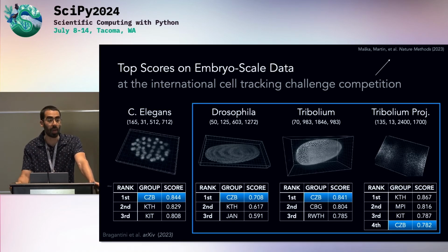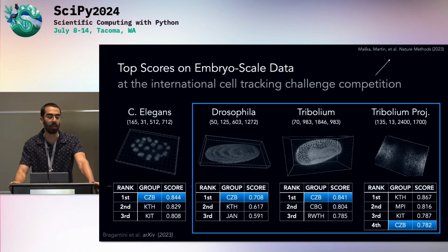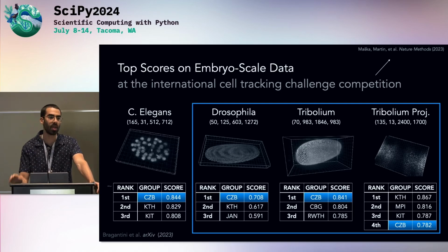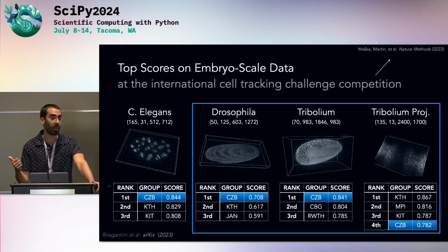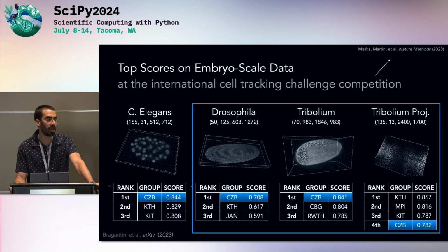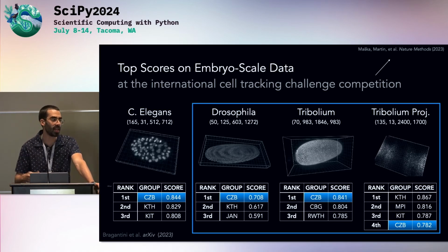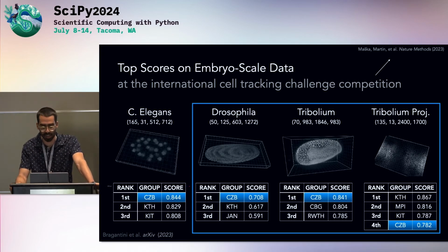So here we tried training our network with pseudo labels. But in the end, what did best was just a traditional image processing approach, where we do as we showed before. We detect the foreground with difference of Gaussians, and then we invert the background and apply some filtering. And I think this is remarkable because with this, first we can interpret the model. We can interpret our results much easier and tweak the parameters, and you can get things done much faster, right? I've seen many times, especially new interns, they want to apply AI, and something that could take like 1 week takes the whole internship, and they're not finished with the project.